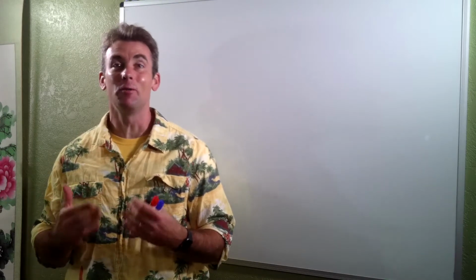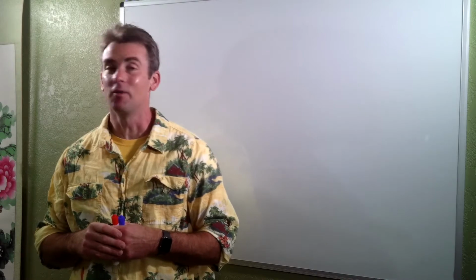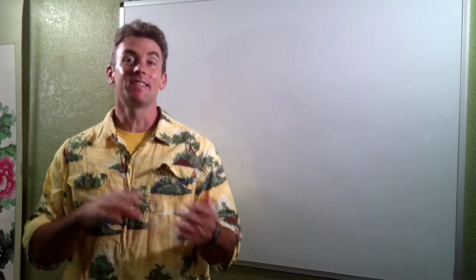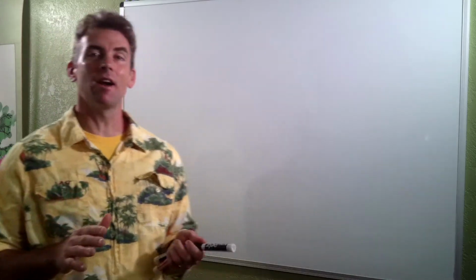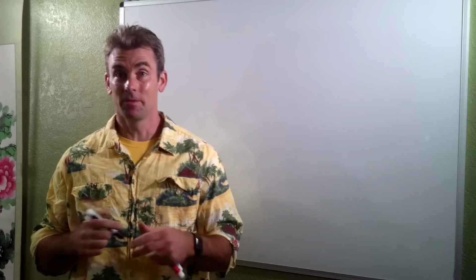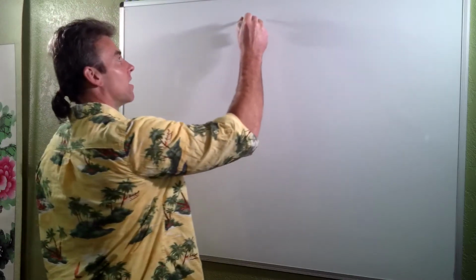So today's lab instructional video will be a lot easier than last time's. You won't have to hear me drone on as much as before. And hopefully a lot of this stuff, at least in terms of the theory, should be reviewed. So what are we doing today? Well, we're starting off with a sample of matter, and like most samples of matter, it's going to start as a mixture, okay? So we are going to start with some matter.